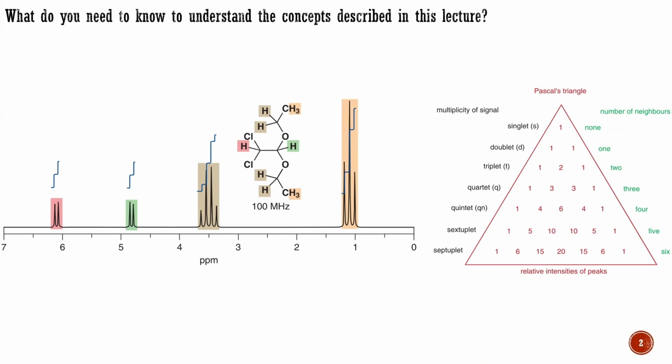You learned that the splitting of the signal and the relevant intensities in the splitting can be effectively predicted by Pascal's triangle. If a proton has more than one neighboring hydrogen atom, and these hydrogens are not similar, then we get a splitting for the signal with different coupling constants. In this lecture, we will continue examining relevant effects conditioning the coupling between neighboring protons and explore how the obtained information can be used to elucidate the connectivity of functional groups by proton NMR spectroscopy.